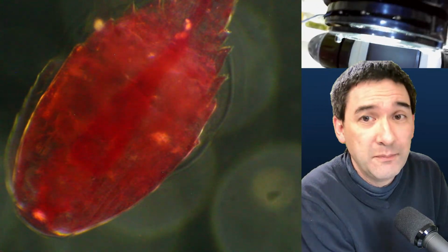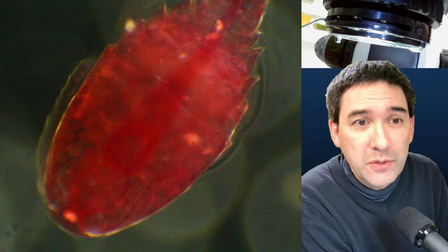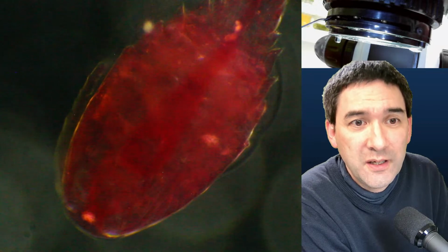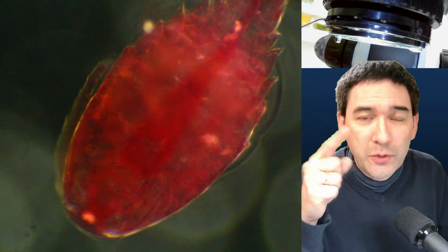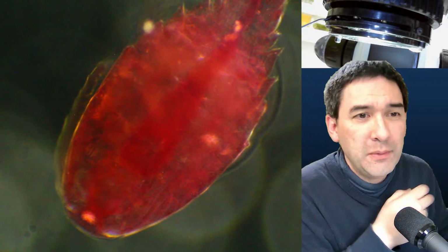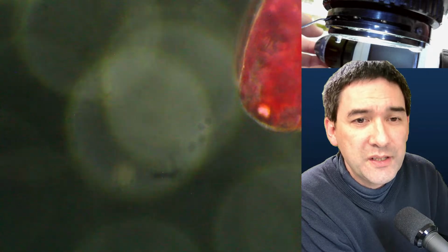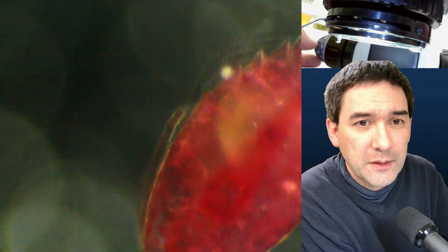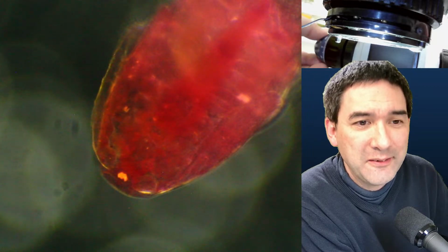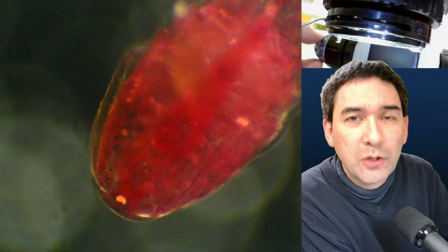Okay, so why is that? The reason is that because of the mounting medium used, the difference in refractive index is not so high. So the specimen does not redirect the light so much into the objective, right? So I really had to turn up the light very much and had to go up with the exposure. But you see, there is not a lot of difference. And now even the background is much brighter as well. Huh? The white dot that you see on the bottom, that's the eye. Okay, yeah. So this is the thing which I just want to illustrate to you, that the dark field is not always suitable.